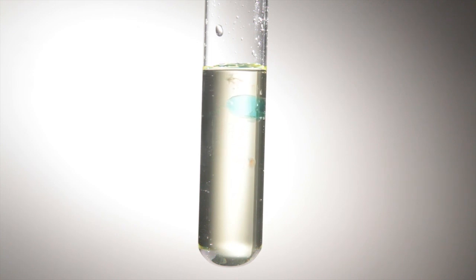If your solutions are very similar in density, then this upwards motion can help the droplets start moving upwards rather than stalling in the middle.